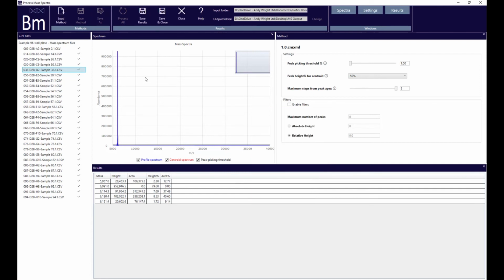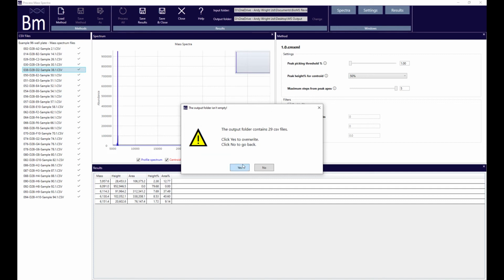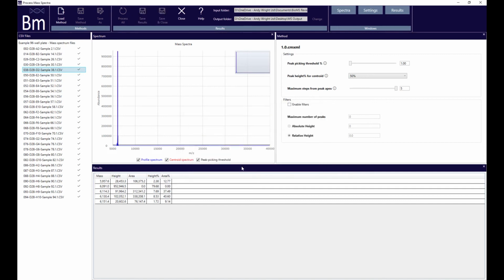Once processed, it is then possible to save the biomolecule files to the directory shown as Output folder in the ribbon. We can close this window in order to load data with our newly created biomolecule files.